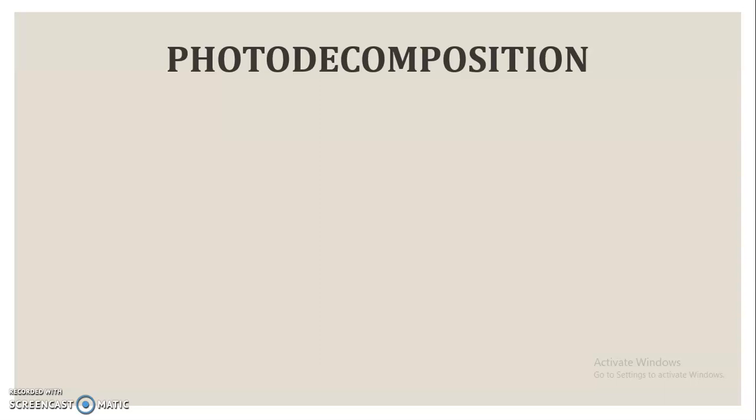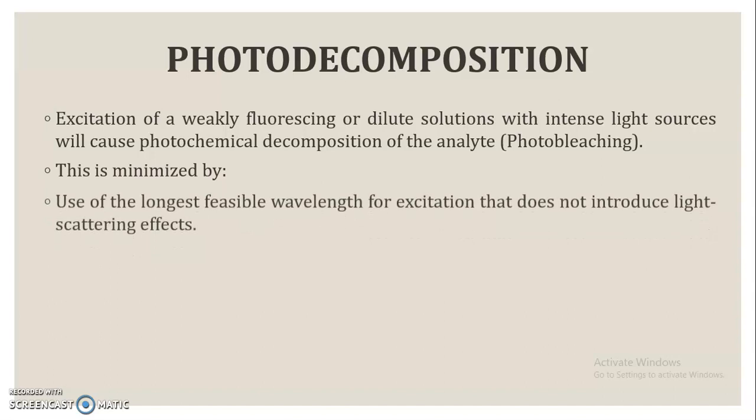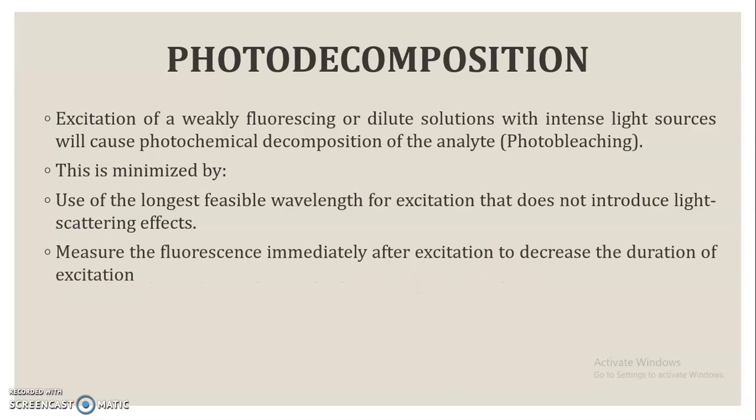Then another term, that is photo decomposition. Now the excitation of weakly fluorescing or dilute solutions with an intense light source will cause photochemical decomposition of the analyte, that is known as photo decomposition. Now this photo decomposition can be minimized by use of the longest feasible wavelength for excitation that does not introduce light scattering effects. Measure the fluorescence immediately after excitation to decrease the duration of excitation.